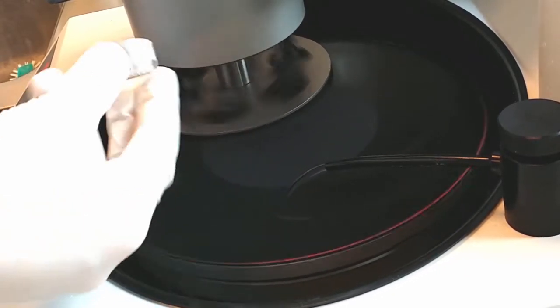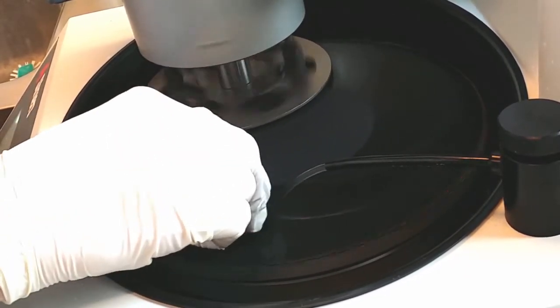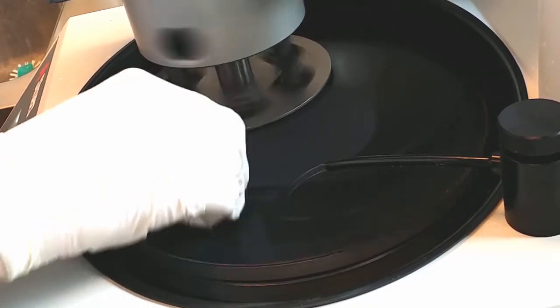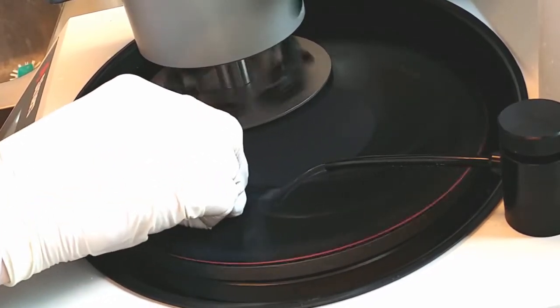We start by grinding off the backside of the sample to make it flat and even. This is used in later stages when we're going to mount it on the SEM sample holder.